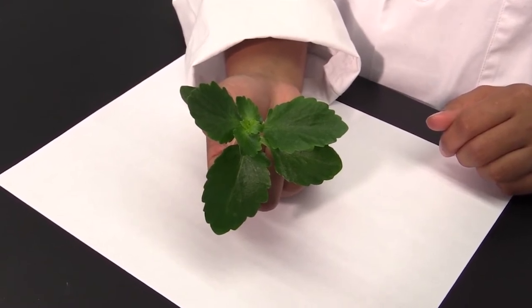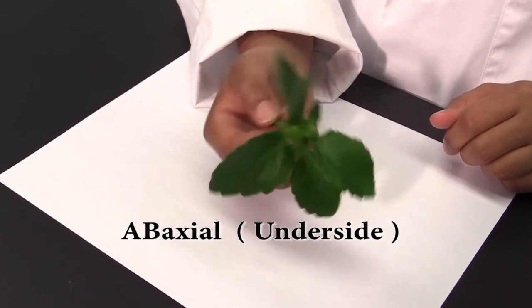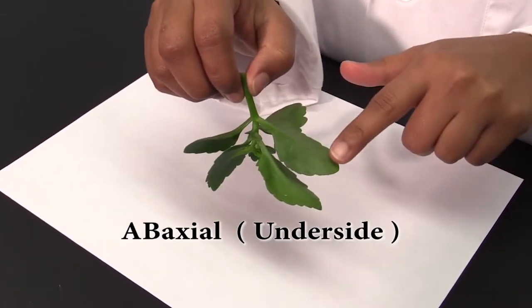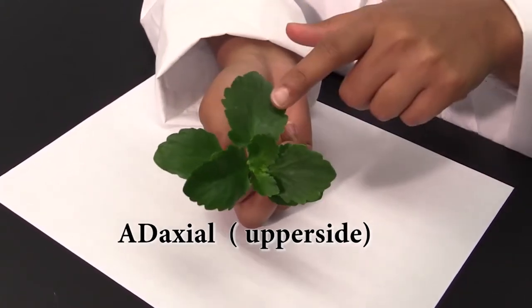Before you begin Part C, it's important to understand the ab-axial, which is the underside of the leaf, and the ad-axial, which is the upper side of the leaf.